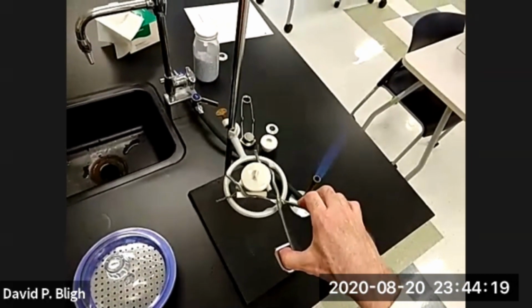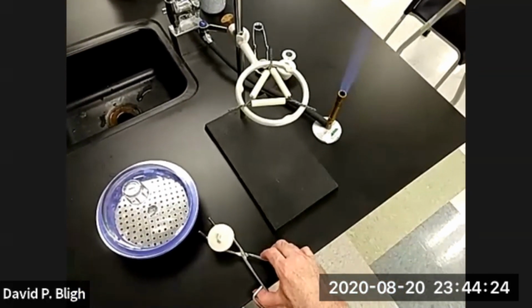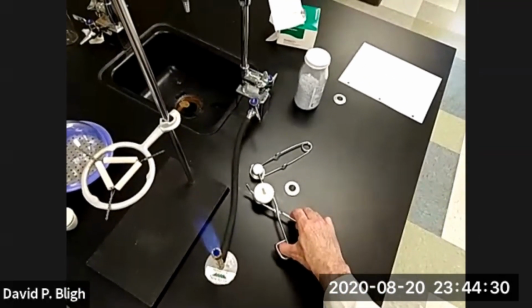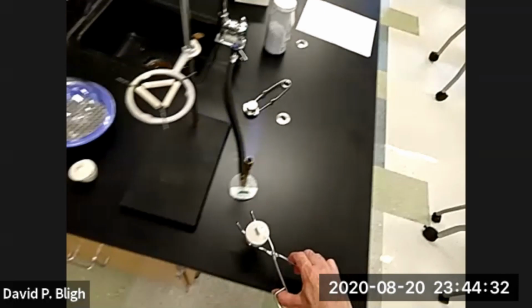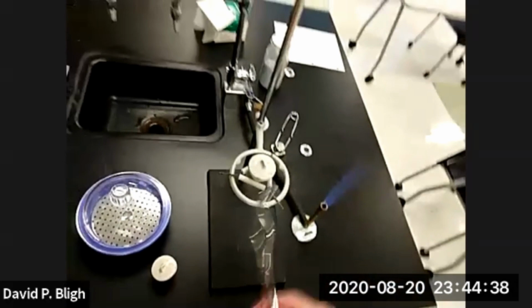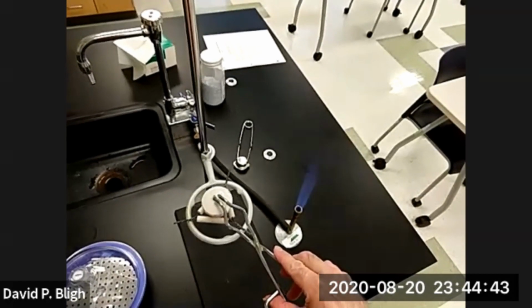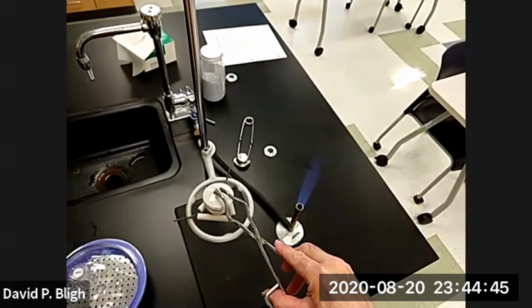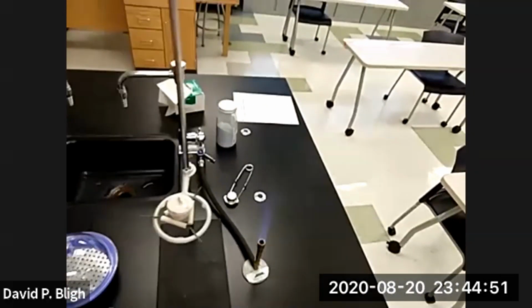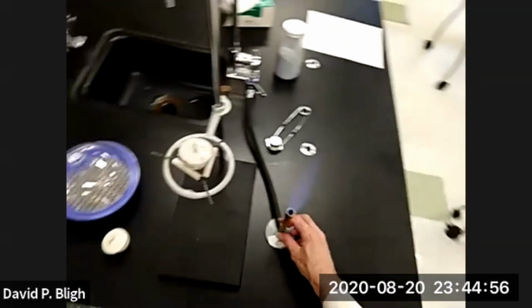But let's take it off of here and set it down here and start heating our copper sulfate hydrate. Very carefully. Set it in the triangle and then offset the lid to allow for water vapor to escape, but not enough gap to lose any material if it spatters. Now let's heat it up.